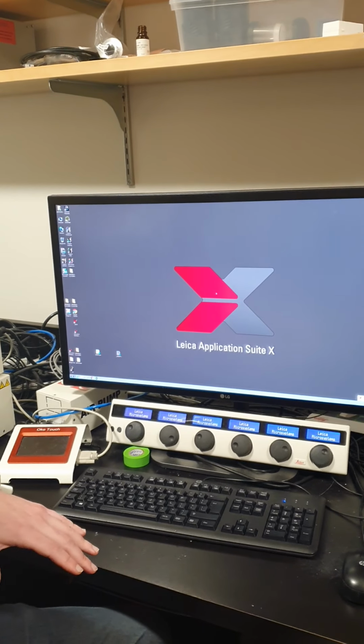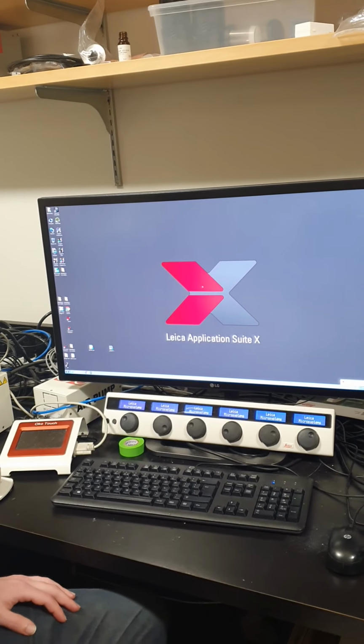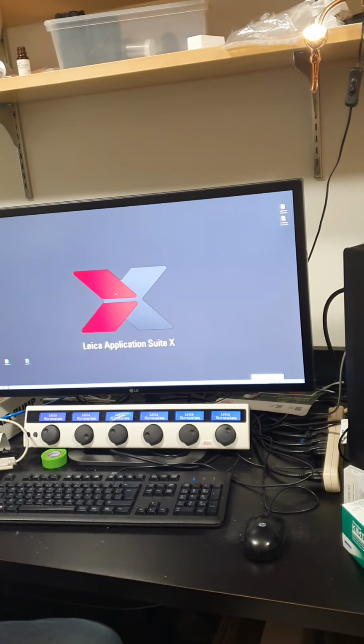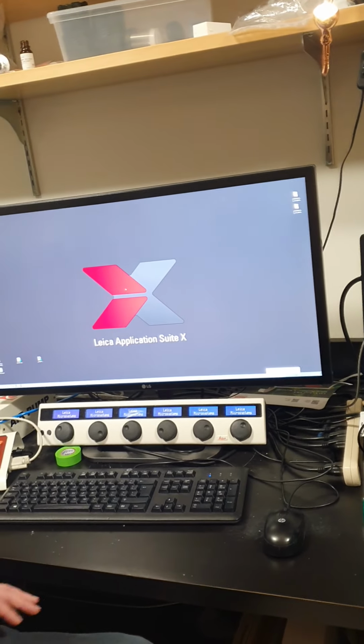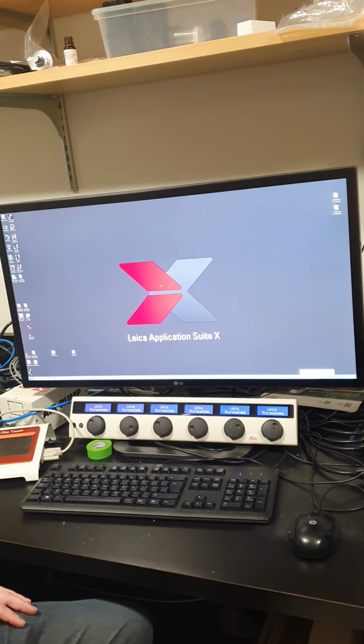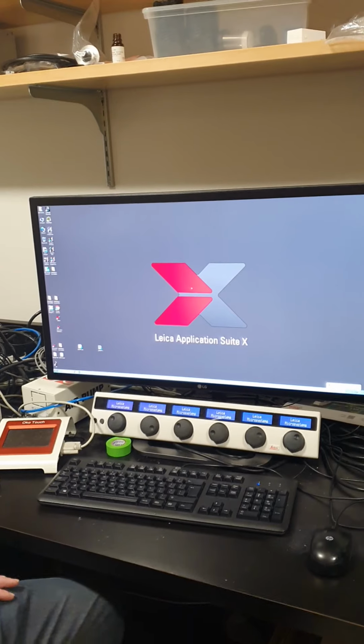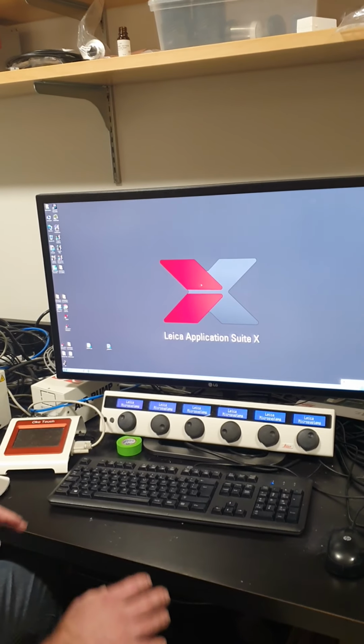Just so I know where we're working from, have people done confocal imaging in the past? I have not used confocal. I did fluorescence. Yeah, me also. Like classic wide field fluorescence. Yeah. Okay, cool. So some people have started with no microscope experience, so no problem.